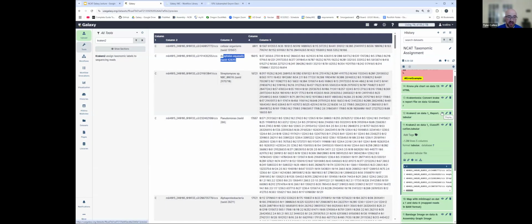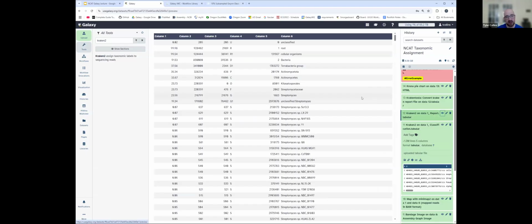What's nicer to look at is that report we had generated instead through that extra flag we had. This will essentially create a slightly nicer human readable version of the actual species with some taxonomic identifier information. But even with this, it's still not super useful for interpreting our data or trying to understand what's there, really moving through it.